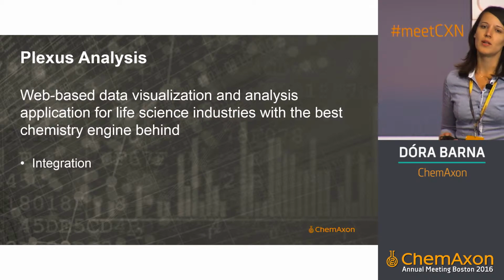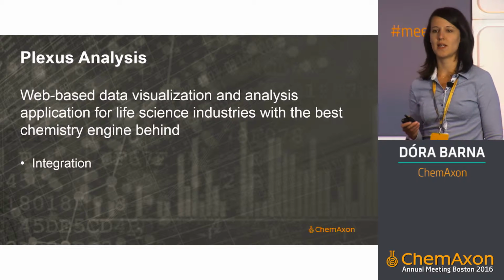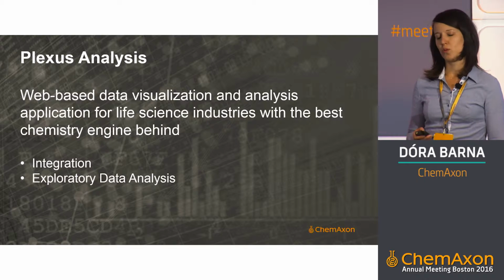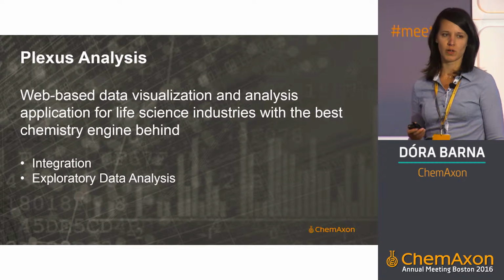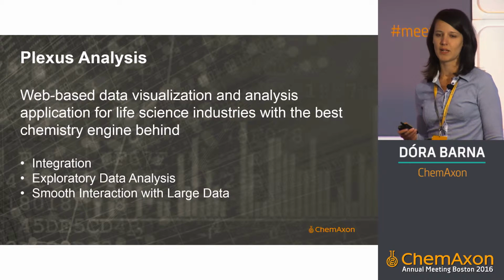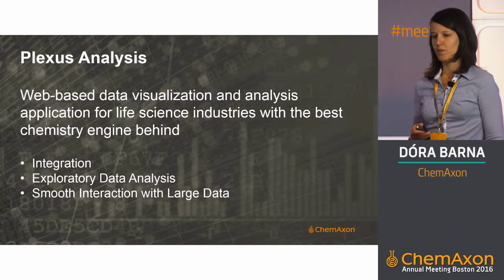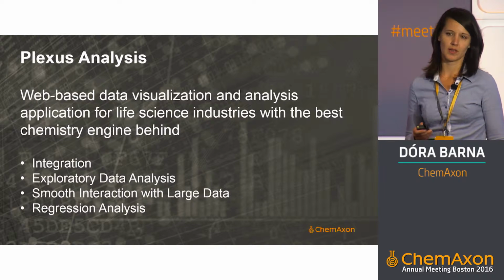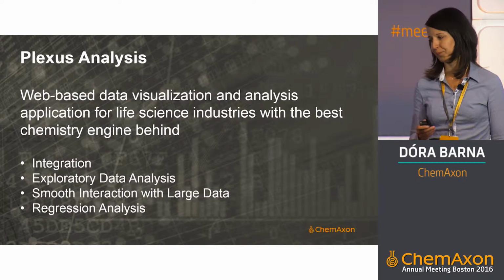And if we want to list its most important features, then we have to mention its integrability, also that it can be used for exploratory data analysis, where it can smoothly and dynamically handle high-dimensional and very large datasets, which can contain even millions of records. And since recently, it can be used for curve fitting and regression analysis as well.